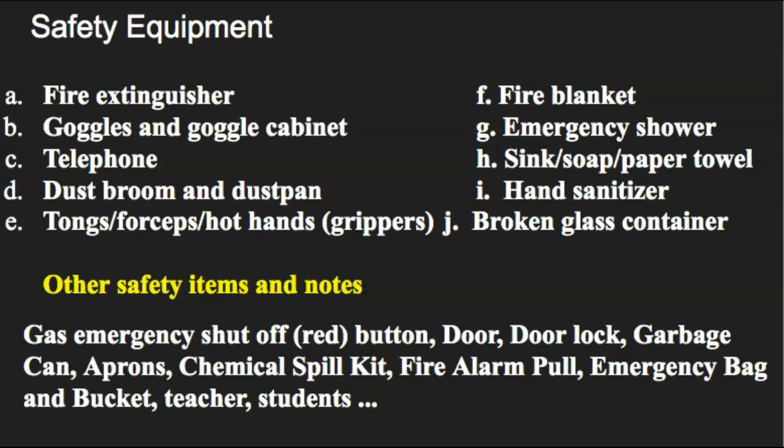All right, welcome back. Well, I hope that you found some things. One of the things you should have found somewhere in our room is the fire extinguisher. Now, it's extremely important to realize that you don't play with a fire extinguisher, and you should never aim it at any person or animal, because the material that comes out of it can be extremely cold, and it can actually give you major complications. If you aim it at somebody who has breathing issues, such as asthma, it could potentially cause them to suffocate or have major breathing problems.